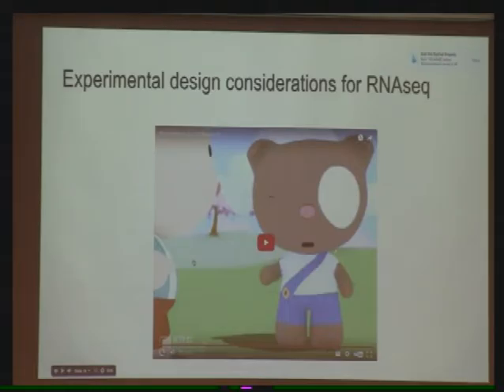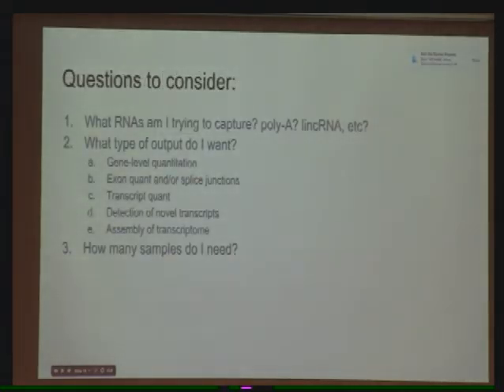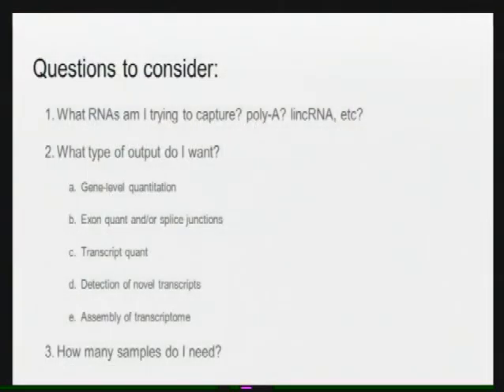And I don't think it's the fault of either scientist that this happens. It's a new technology. It has different properties, and it takes a while to design your data for it. So I may be beating a dead horse here on this topic, but here are some things to think about when you're doing an RNA experiment.